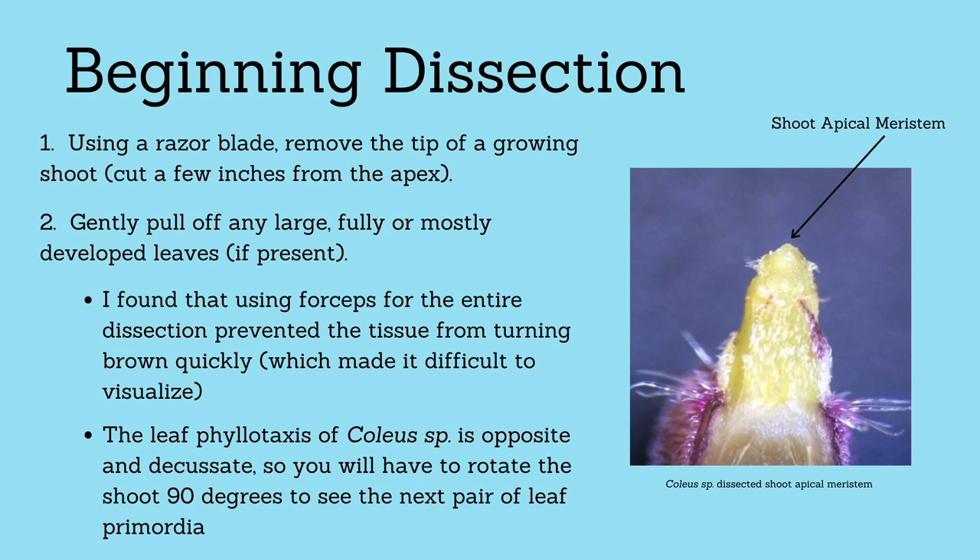If you plan on performing this dissection yourself, here are some helpful tips. I found that using forceps for the entire dissection prevented the tissue from turning brown quickly, which made it hard to see the shoot apical meristem and what you were doing.